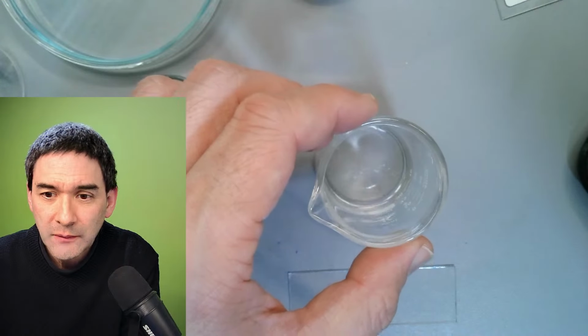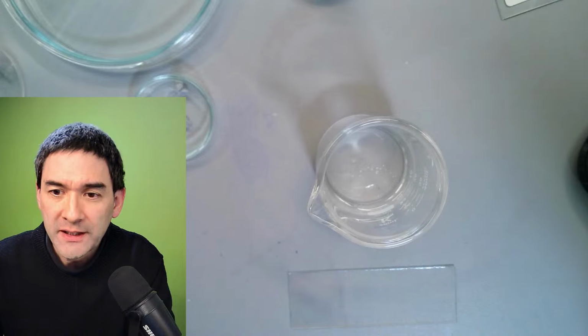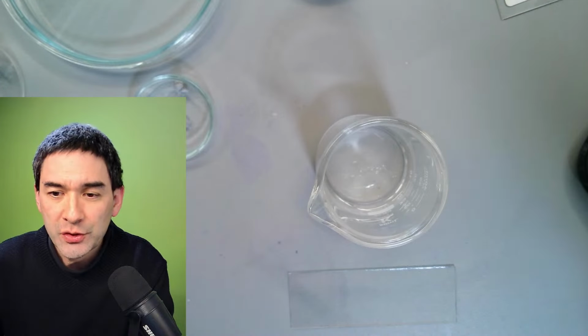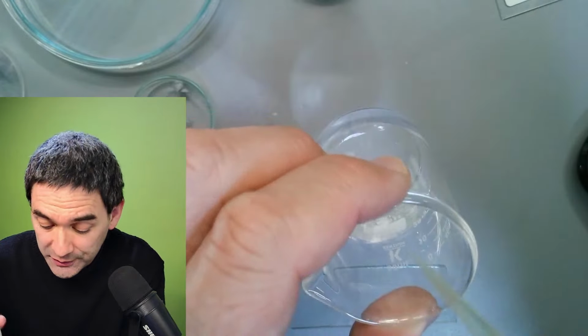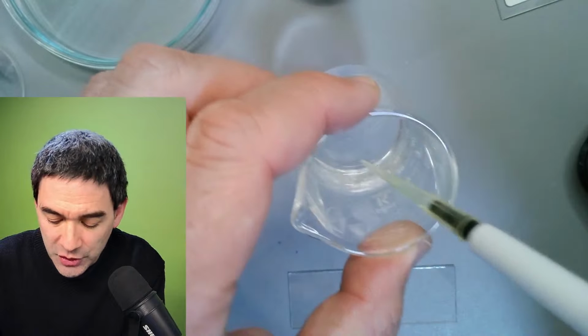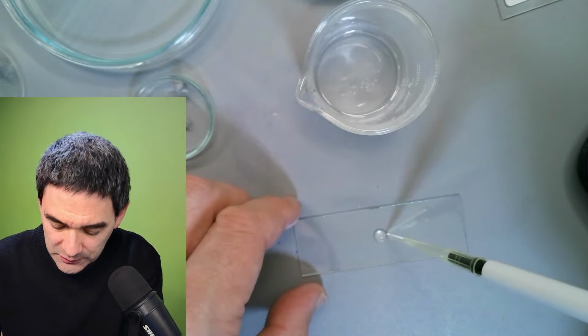Okay. There's a very common quick question here: how can you find out if fibers are natural or synthetic? I'm going to show that to you with the soldering iron. But I just want to show you a sample from over here.